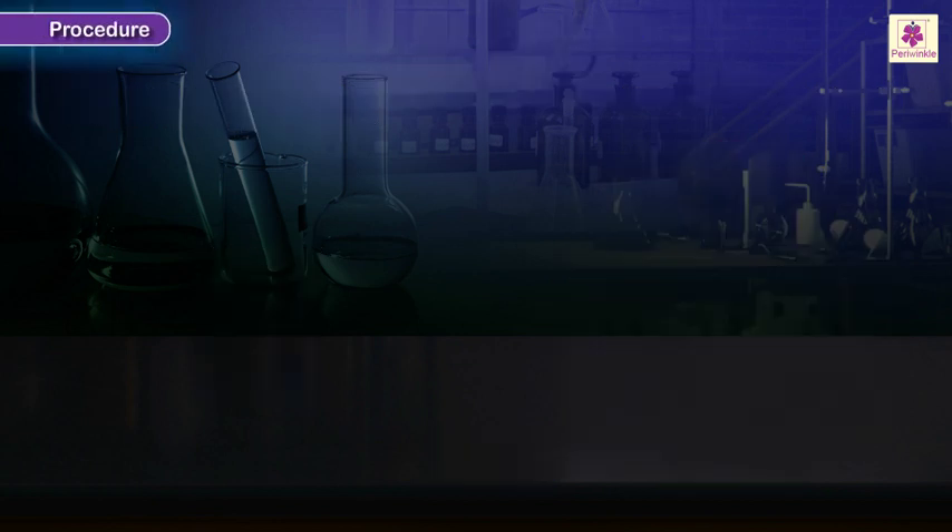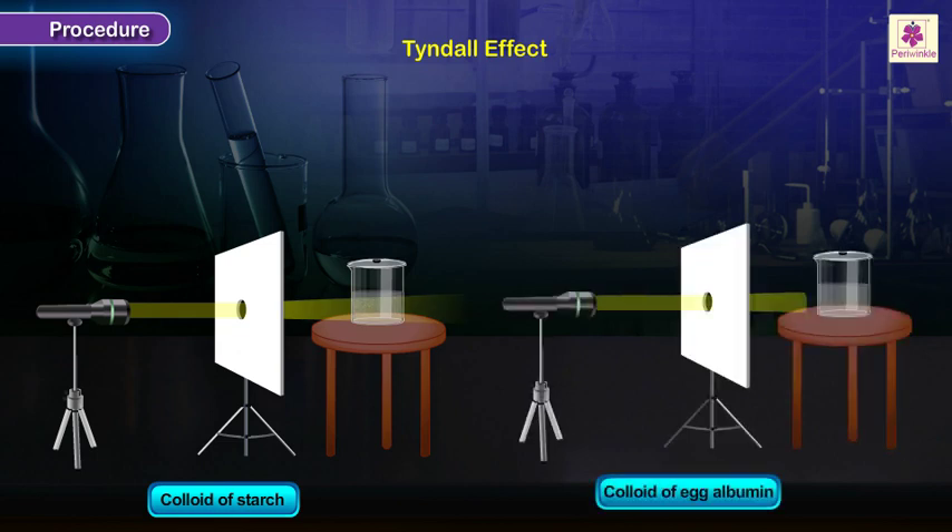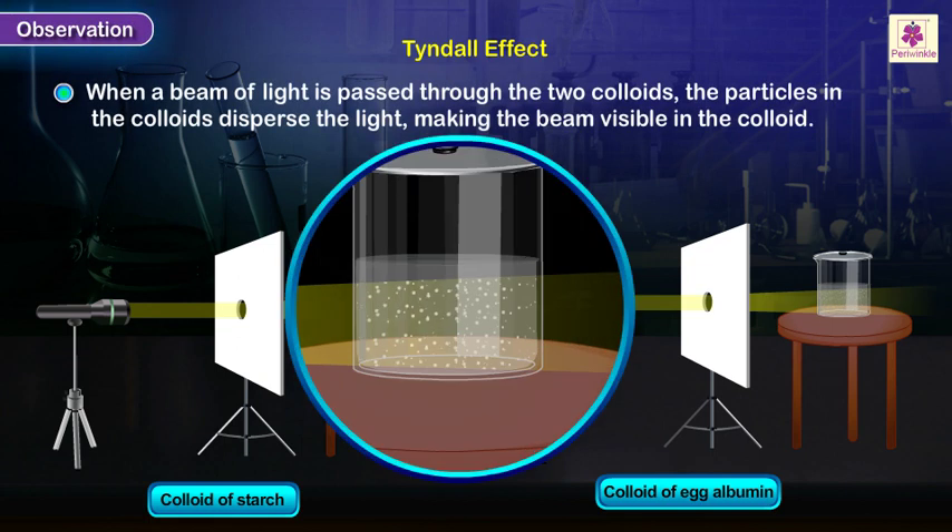In a darkened room, pass a beam of light through the two colloids and observe. Observation: When a beam of light is passed through the two colloids, the particles in the colloids disperse the light, making the beam visible in the colloid.